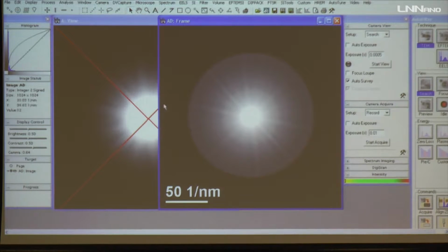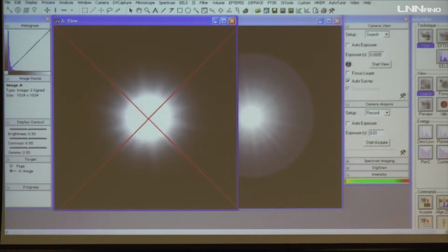And here we see, the difference between this one and this one is the acquisition time. You see here, for viewing, we are using 0.1, 2, 3, 4, 5. So 1, 2, 3, 3 zeros and 5. And here we have 0.01. So that's the reason we are able to see the lines. These lines, I believe by this time you would have known, are called Kikuchi lines. Now I'm in zone axis. Now I want to show you guys the 110 diffraction pattern. For doing that, I go back to imaging mode again.